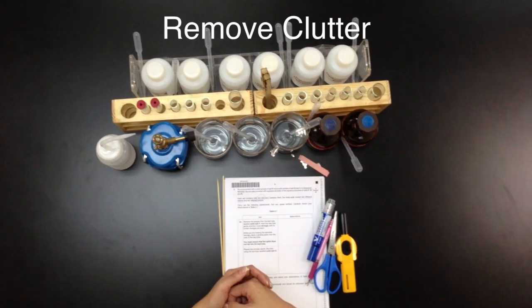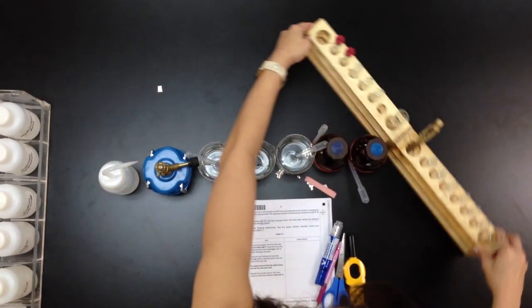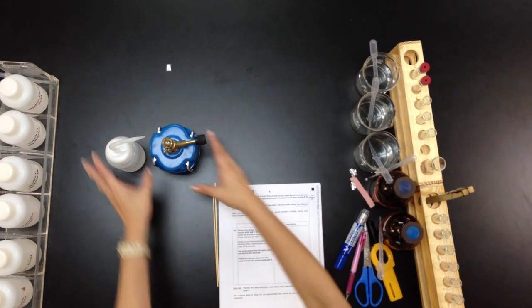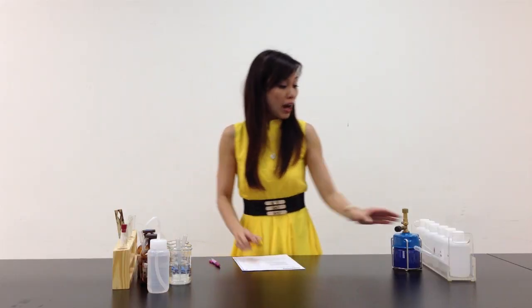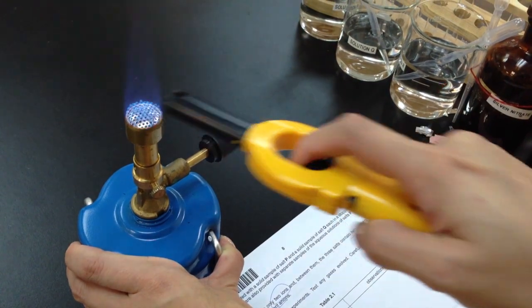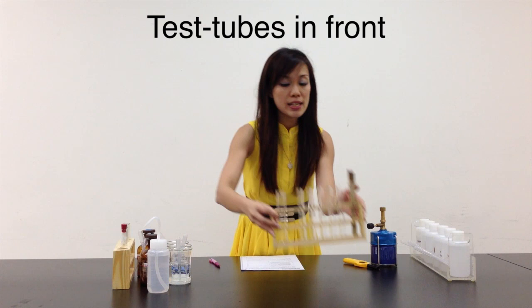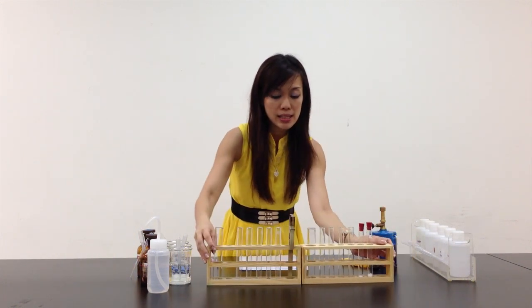Let's clear the clutter first. My clutter is clear. I always like to test my Bunsen burner first before I start any experiment. Let's see if the lighter is working. Test the Bunsen burner — everything is working well. Let me put this aside. I like to put all my test tubes right in front of me so that I can access them easily.